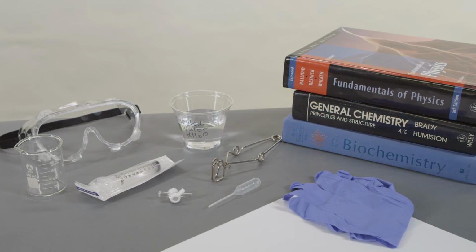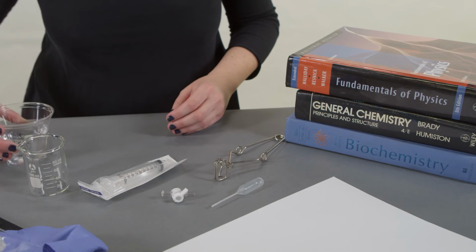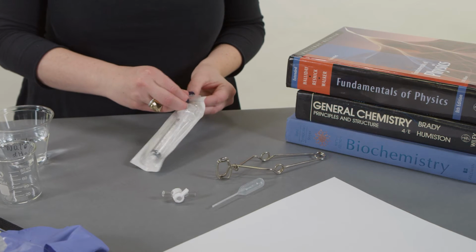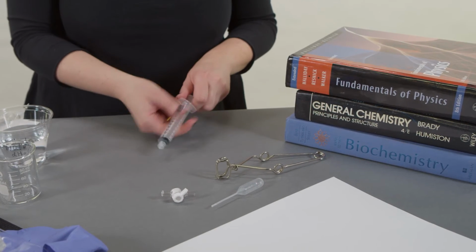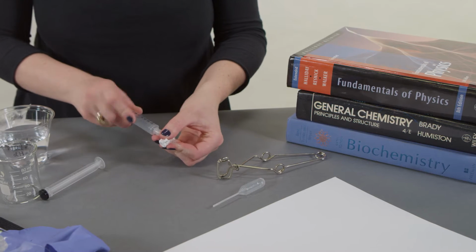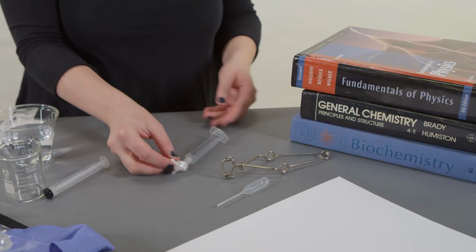In your kit, you will find all of the materials necessary to create a burette for titrations. While yours will look physically different than the burette you might see in a laboratory, it performs the same function. Remove the plunger from the syringe. Attach the stopcock to the tip of the syringe and twist it into place. It should fit tightly into the syringe so that the liquid will not leak. This will act as the burette.